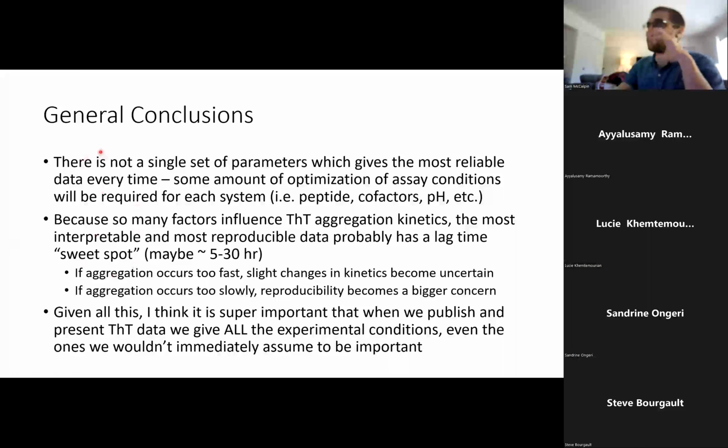So just to summarize some things, maybe some ideas from all of the presentations today. Obviously there's a lot of optimization here that you're probably going to have to do for each batch of peptide, each set of sample conditions, and you're not going to come up with the same experimental parameters or instrument protocol each time, and you're probably going to have to put time in to optimize that.